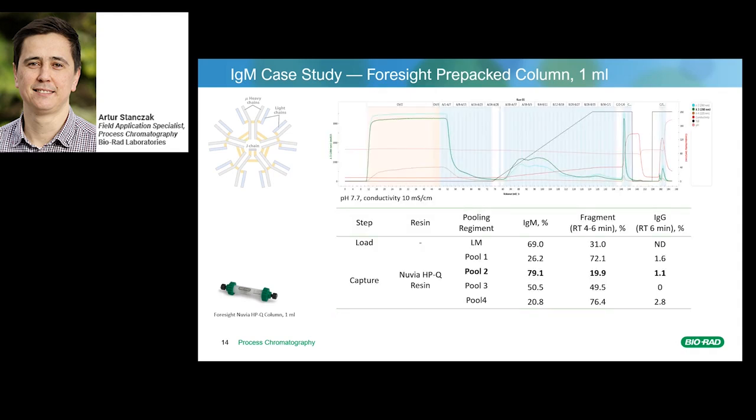On this slide, the same chromatography run is discussed as on the previous slide. Results for the size exclusion HPLC analysis show that pool 1, which was collected first, contains fragments. The second and third pools contain the majority of the target IgM, but the purity was not great at this stage. This observation supports the hypothesis that smaller fragments have a lower number of binding points compared to the intact IgM and elute earlier in the salt gradient.